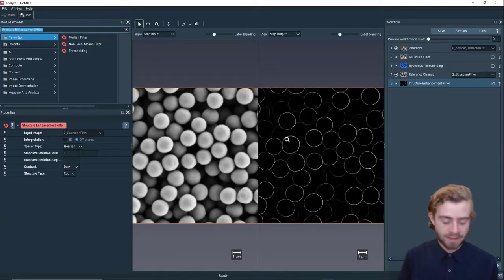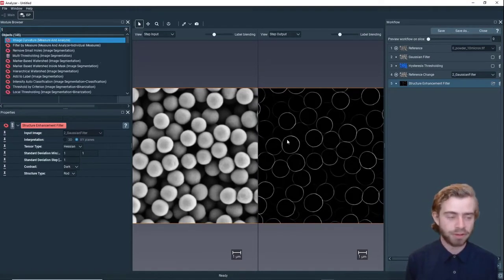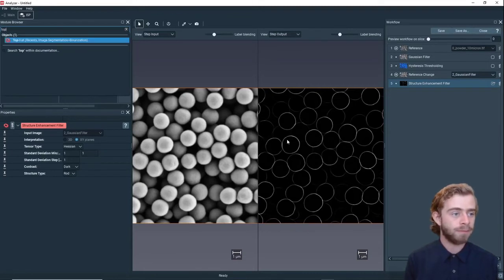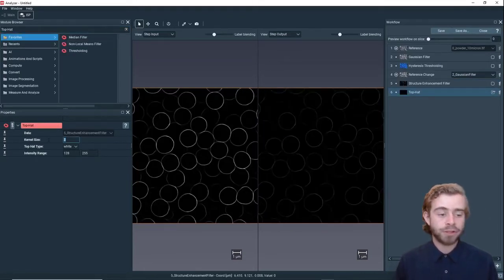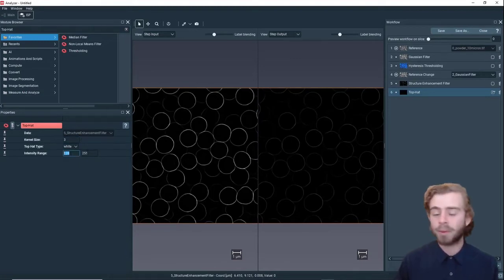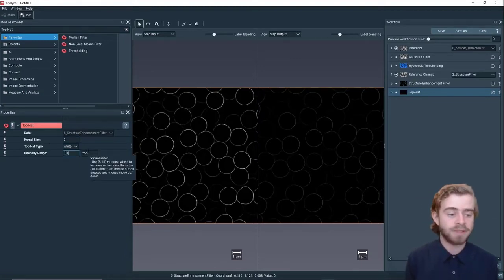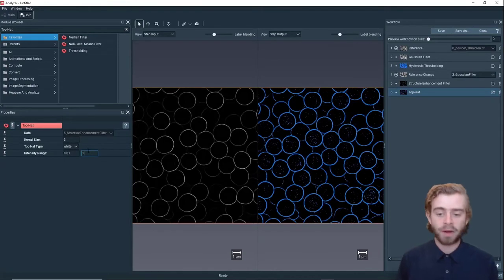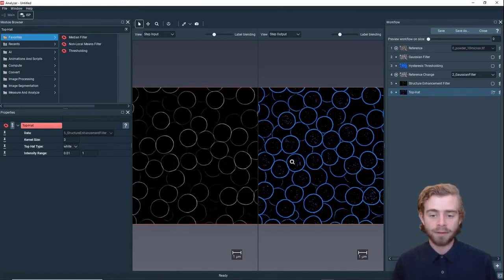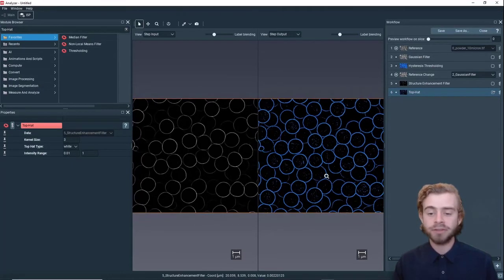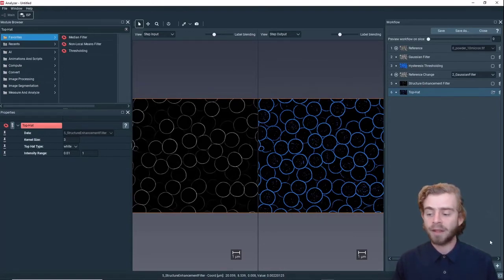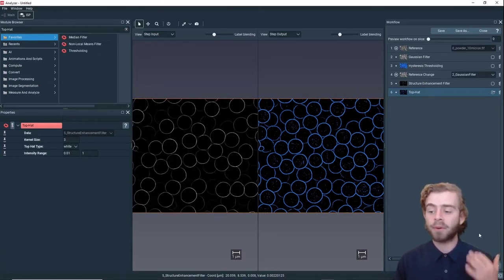The next thing we want to do is segment these outlines out. To do this we're going to use the Top Hat Filter, and we're going to keep the kernel size at 3 but change the intensity range from 0.01 to 1. As you can see, the step output is the outlines of each of the particles, and there's some little noise in the middle but we can fix that.